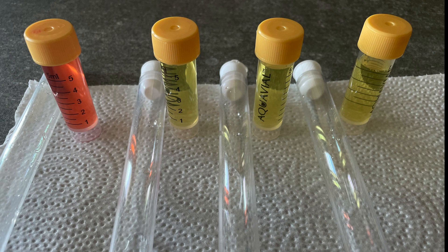After 24 hours, the original water source tested pink, which means it had signs of bacteria. The samples from the filters all showed that there were no bacteria detected. Here's a quick look at what the dirty water looked like under the microscope — you can see there are a lot of large particles floating around. Moving over to the filtered water, you can see these products did a great job at removing the solids, with no discernible difference between the end results of each filter.